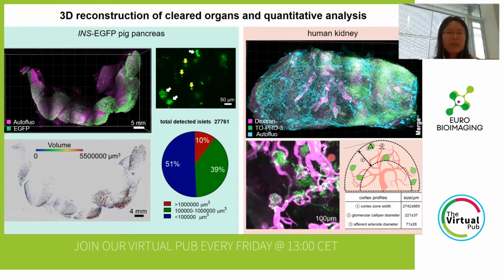First, handling this big data is quite slow. And most of the quantification methods in this software are based on filters, for example a threshold of the brightness of the signal.